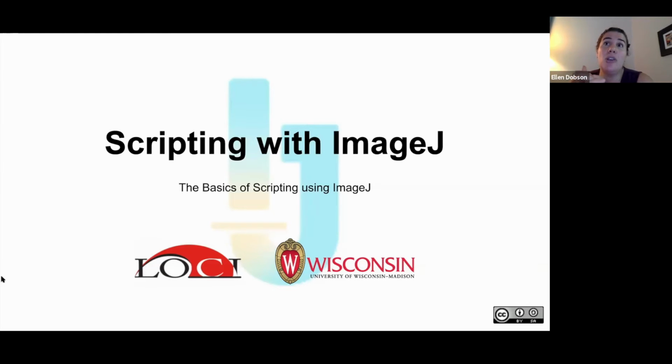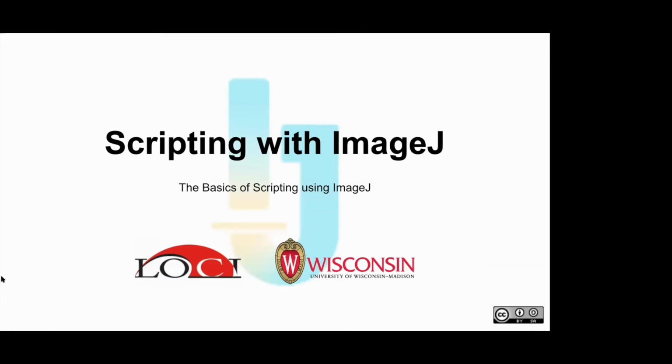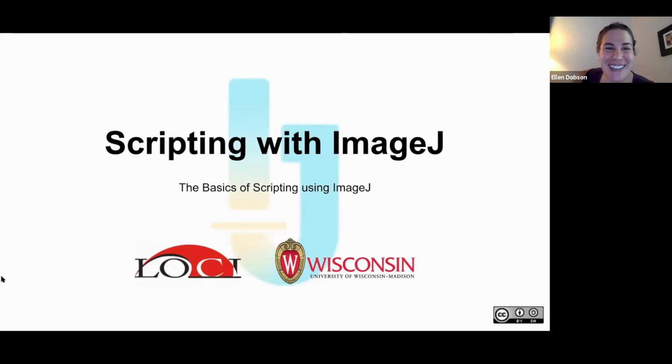But it would be good to ask the general community what would be an accepted method, based on the biology and what I'm trying to measure in my images. But I'm pretty sure it's the average projection. Oh, okay, excellent. Thank you. But don't quote me on it, just double check.